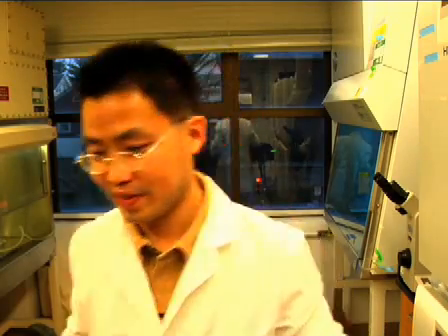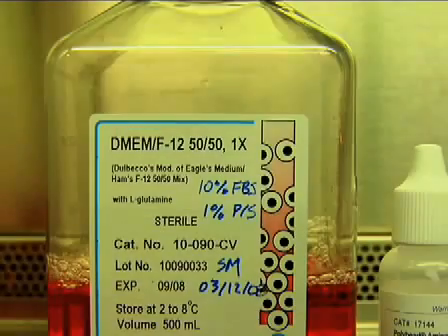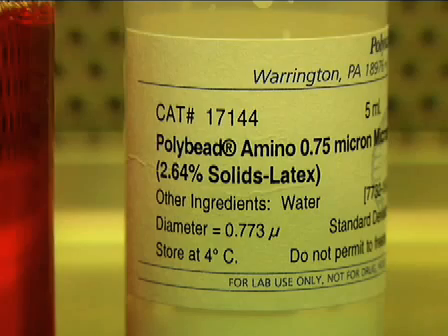Once the 24-hour incubation is complete, we proceed with inducing membrane biosynthesis via phagocytosis of latex beads. To begin, prepare a suspension containing cell culture medium and latex beads.